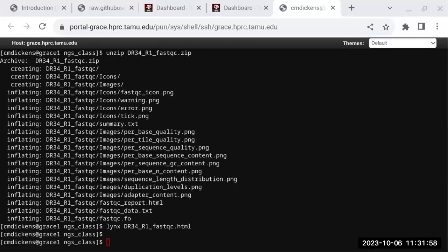Here's an example of what this QC profile looks like, something of a sequence run that failed, or what you can consider failed. It just looks horrible. You don't see a lot in the green and then it slopes down to the red. You just see it all over the place. A lot of this is in the red. Hopefully you won't get something like this from the sequence center, but what this was, it was an expired kit.